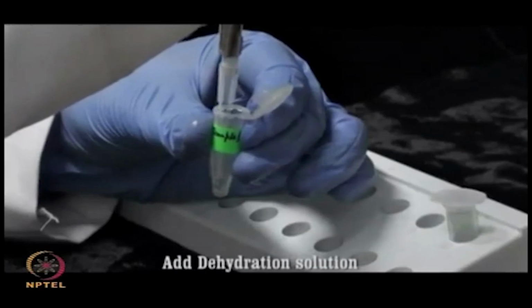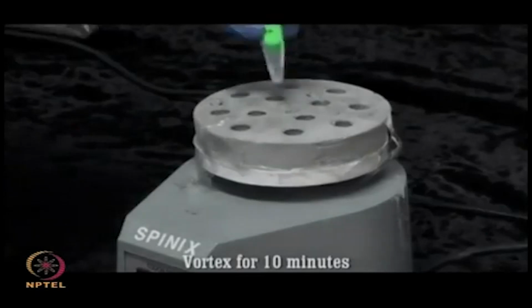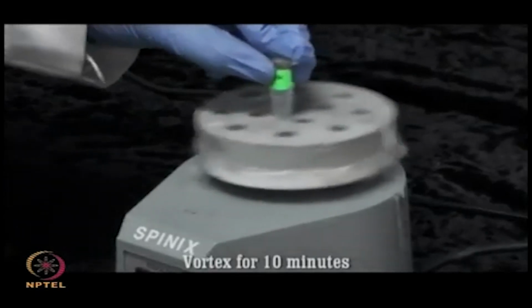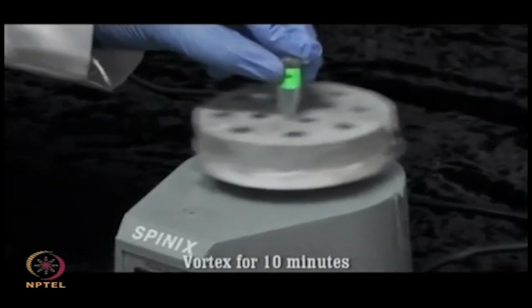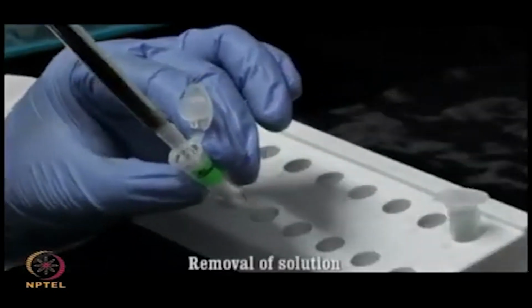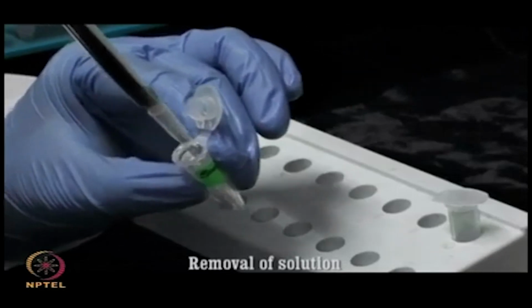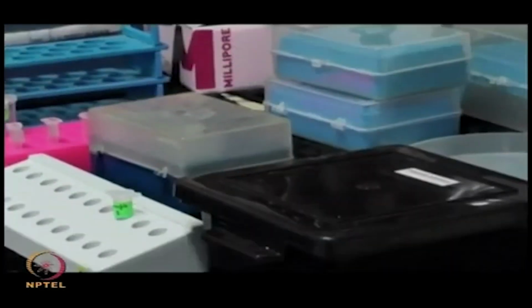Now, add 50 microliter of dehydration solution, mix it properly by vortexing and incubate it for 10 minutes. Again, you need to remove all the solution.